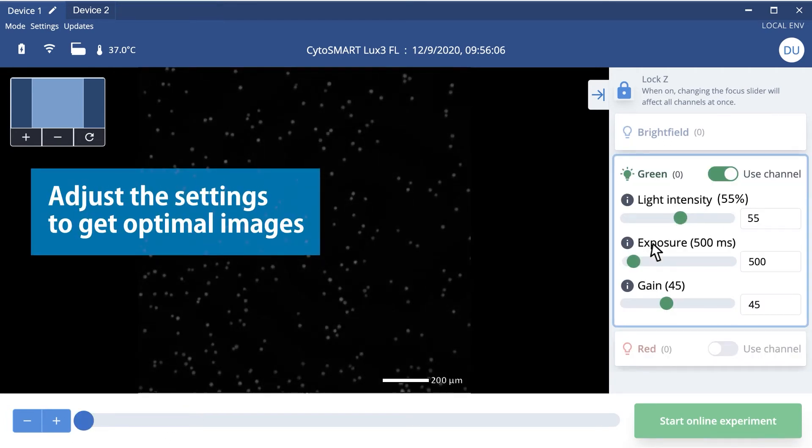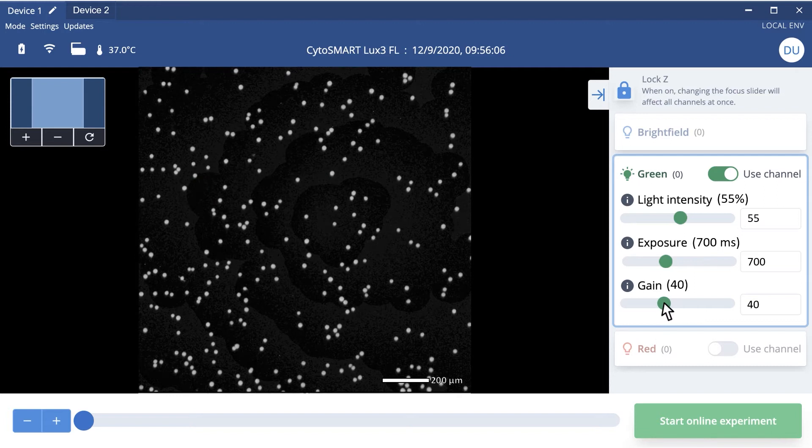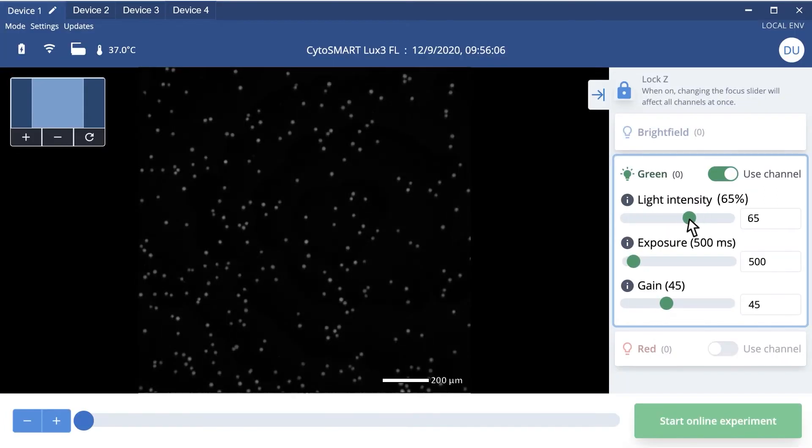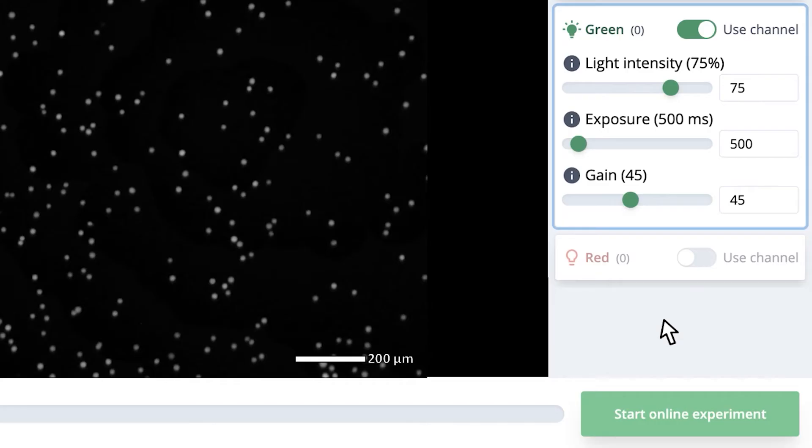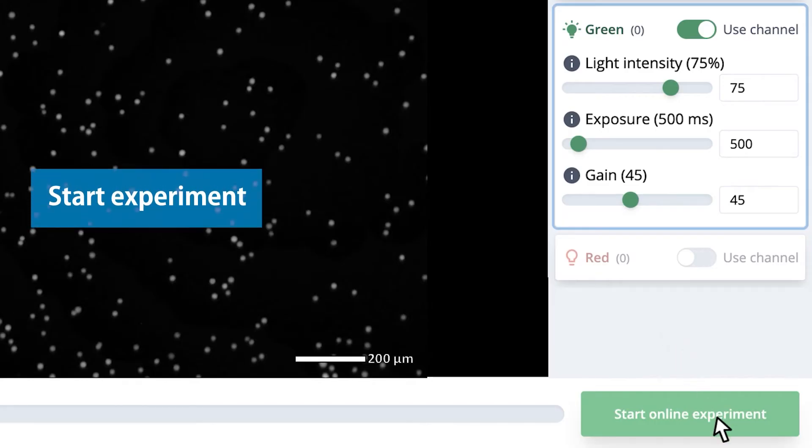Adjust the settings for bright field and fluorescent channels to get optimal images. Beware that too large of a light intensity or exposure time can harm your cells. When you're satisfied with the shown preview, it's time to start your experiment.